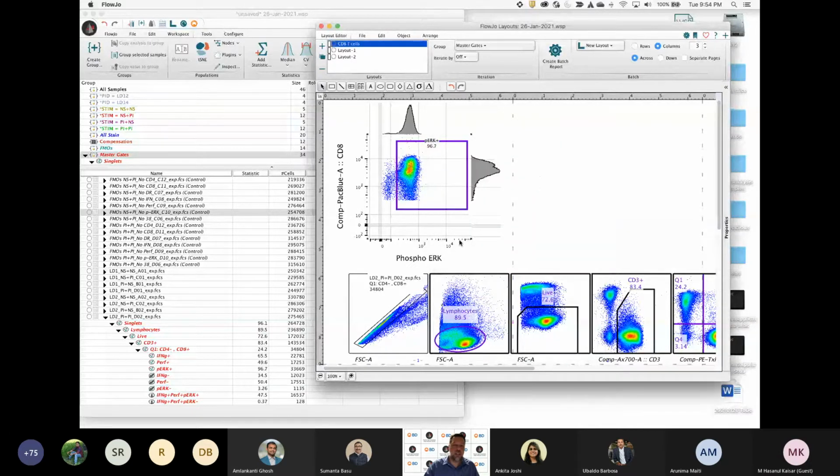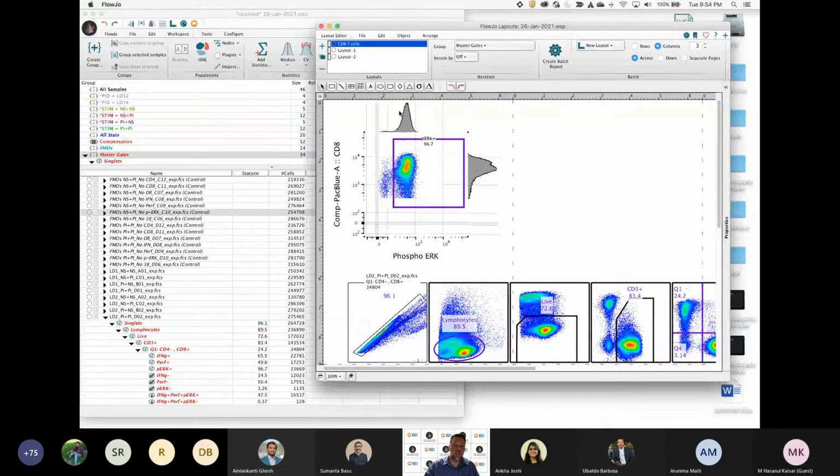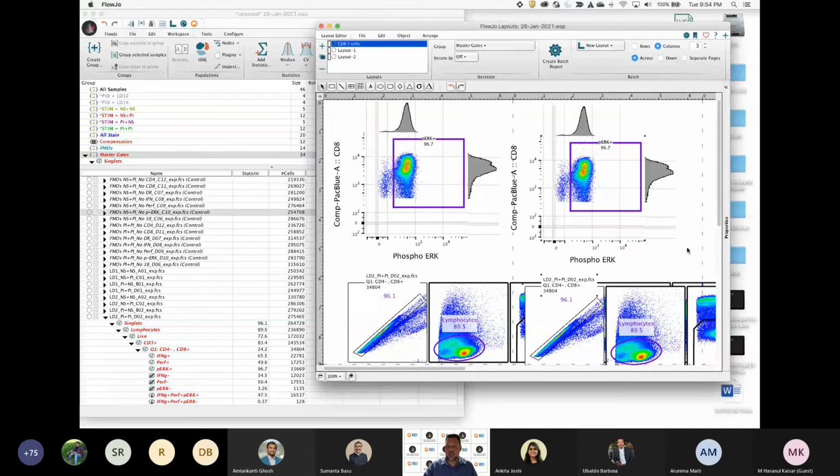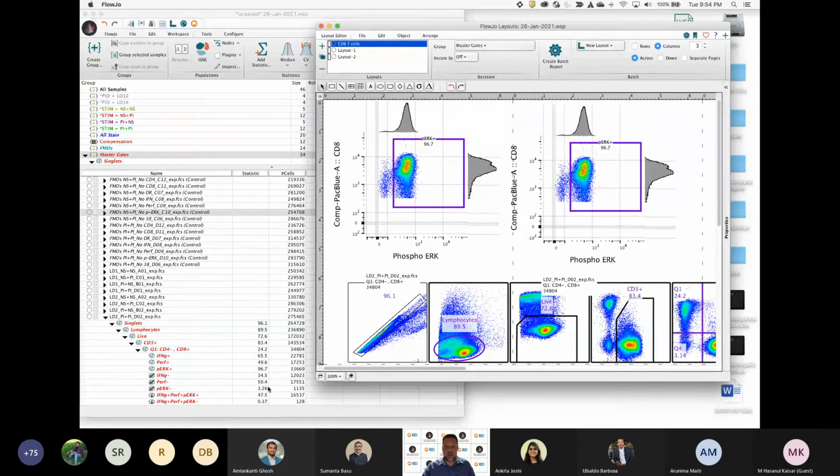And then maybe I'll duplicate this plot since I made some formatting changes and added some stuff. I'm not just going to drag it over again. I just want to show a different set of parameters here. So I can go ahead and right click and duplicate this plot, move it over. Maybe I'll delete that extra set of thumbnails.